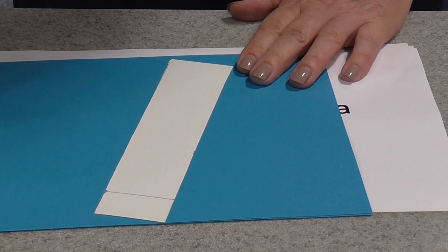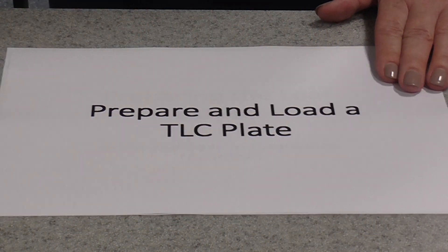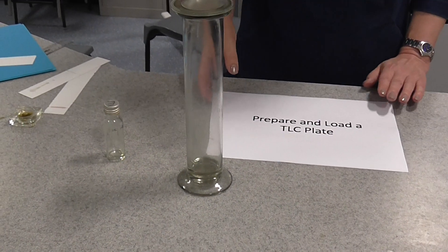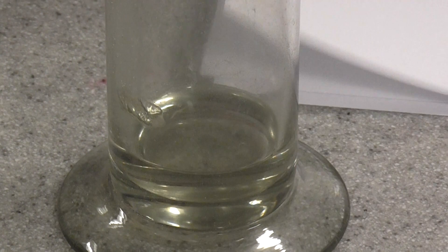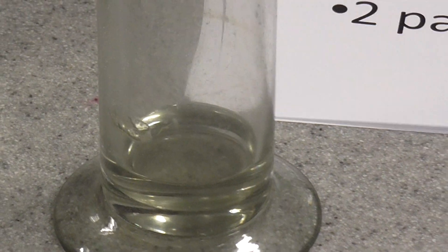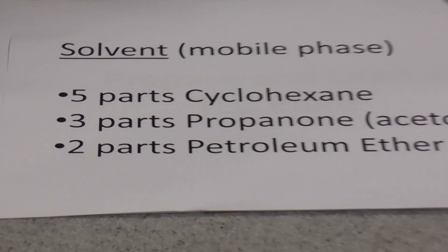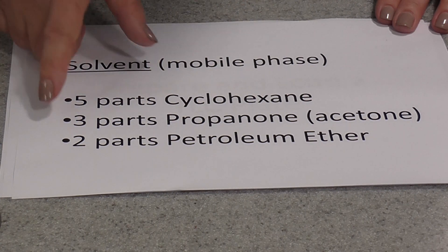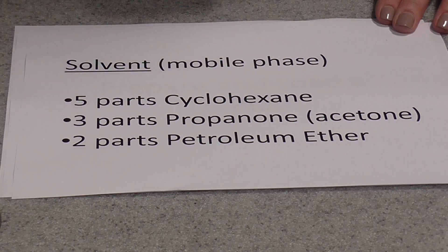While you're doing this, the next thing you could do while waiting for your leaves to soak is put your solvent, which will be the mobile phase, into whatever vessel you're using for your chromatography. I'm using a gas jar here. Now into the bottom of that gas jar, I've placed my solvent. The solvent in this case is five parts cyclohexane, three parts propanone or acetone, and two parts petroleum ether.